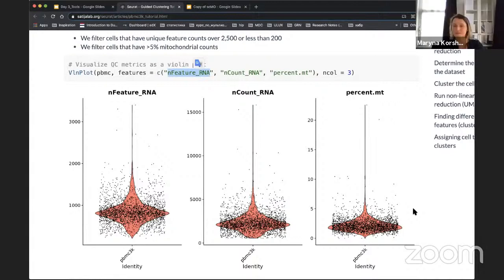Yeah, that is why there is no standard cutoff. So it's very context dependent. Actually, you can also apply this cutoff for ribosomal genes. It's not so widely used, but as an alternative for some cross-validation or as an auxiliary metric, you can use that. However, other metrics, other parameters are also used for data filtering.